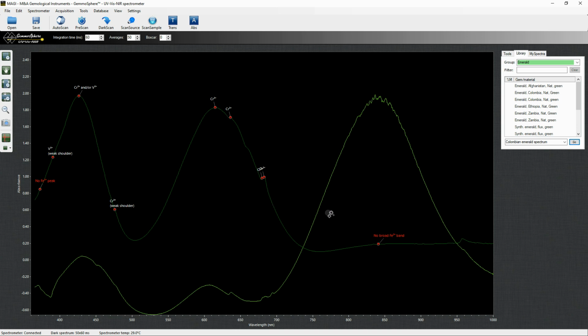We can now conclude our stone is not from Colombia, even if, in order to speculate about its country of origin, far more indicators need to be collected by other techniques. By the way, this is an Ethiopian Shakiso emerald.